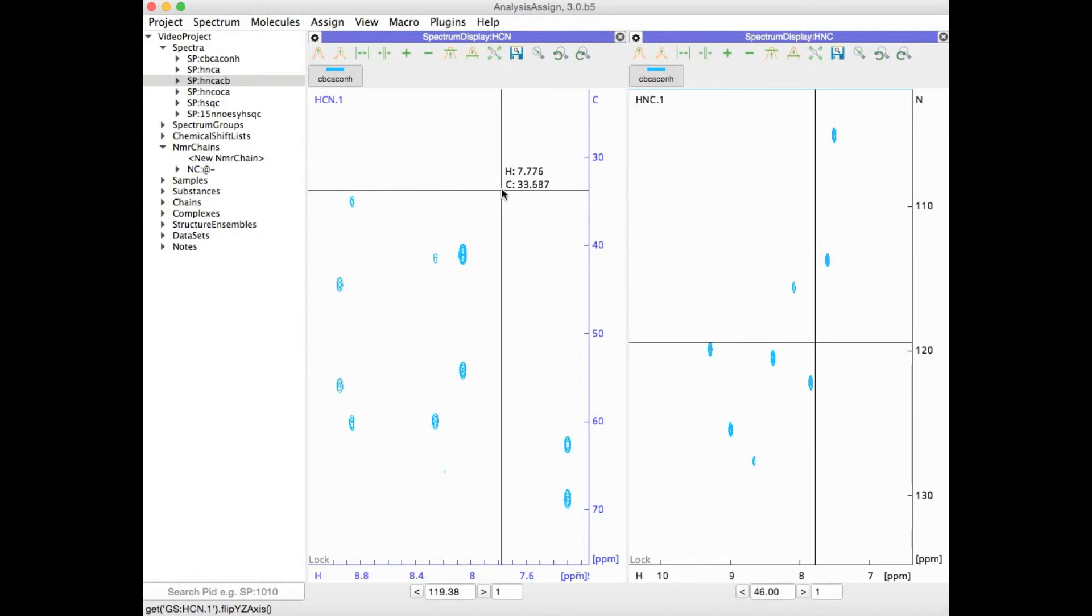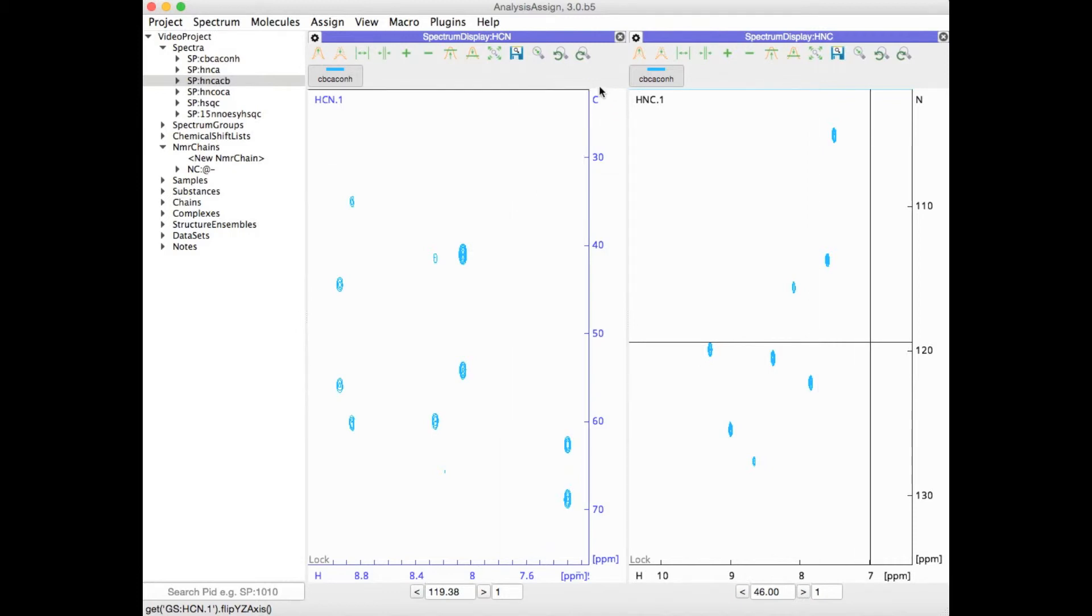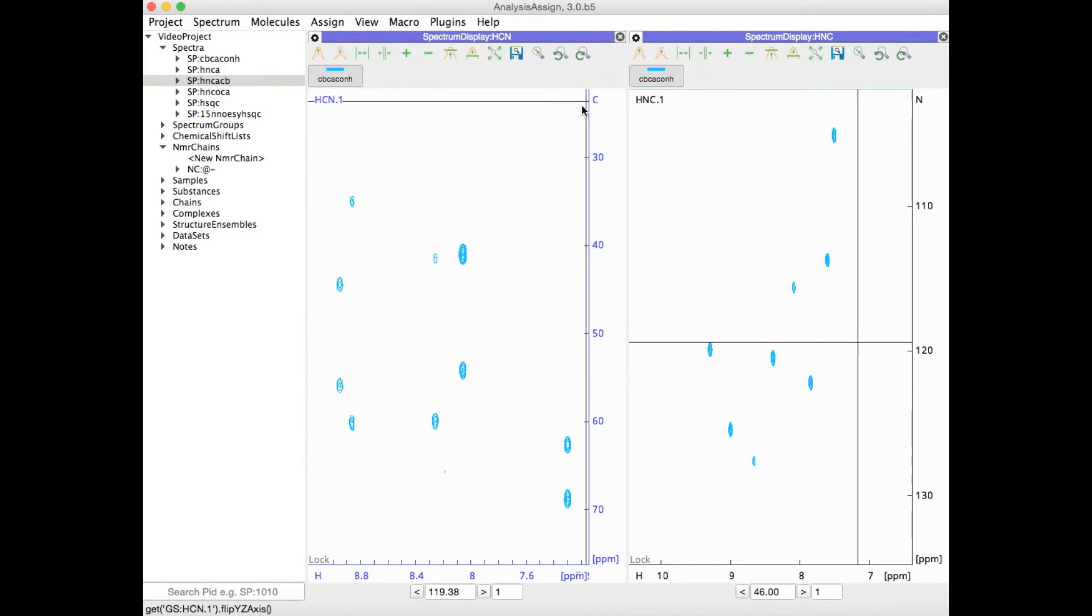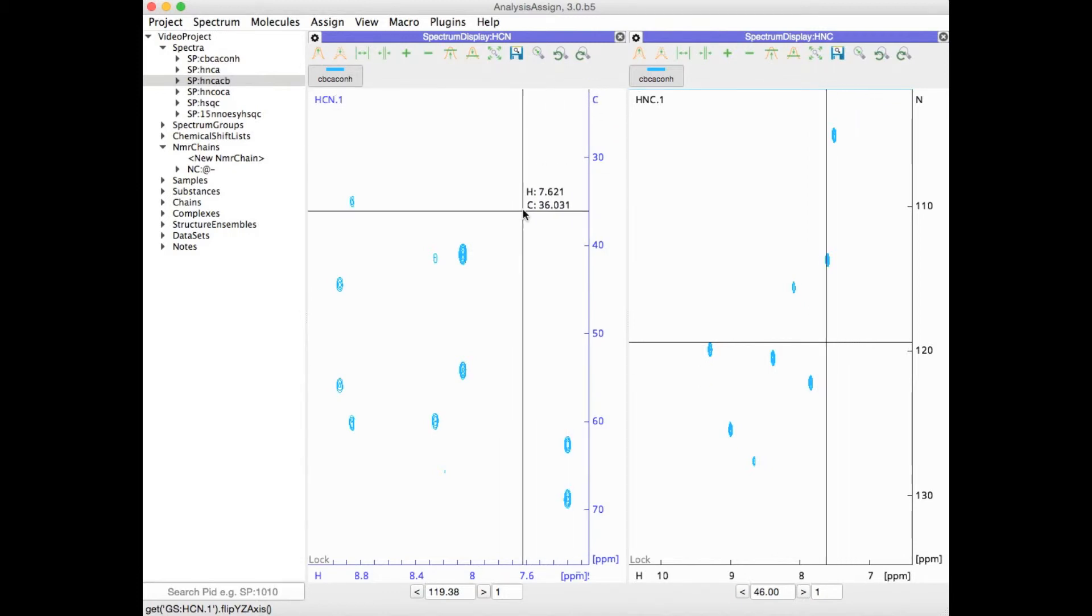For triple resonance spectra, our default is to have carbon along the Y axis and nitrogen along Z.